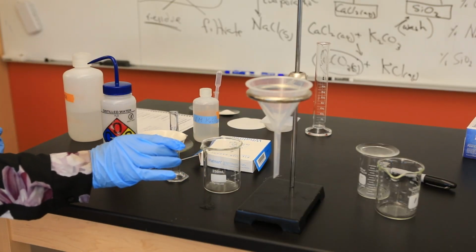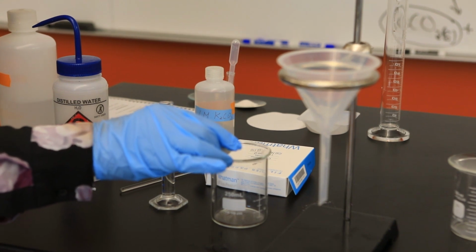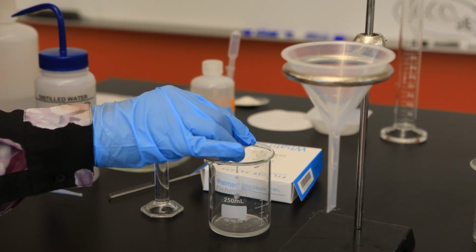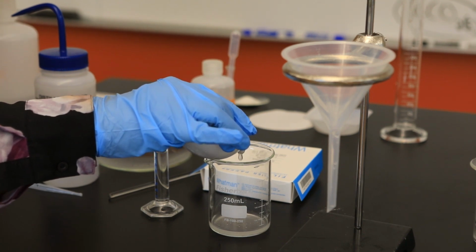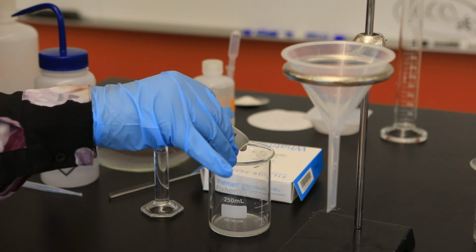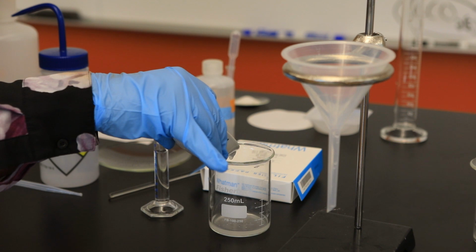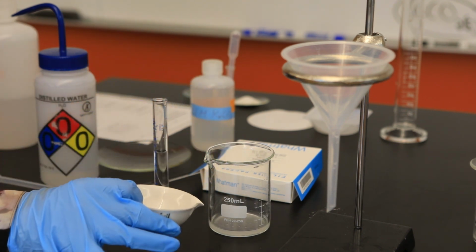As careful as possible, I'm going to decant, and all I mean by that is to pour off the water, and hopefully what's remaining will just be sand and calcium carbonate. But if you notice that the water is a bit cloudy, what does that indicate? Do you guys agree? That unfortunately we're losing some of the calcium carbonate. That's oftentimes the most difficult for us to recover.